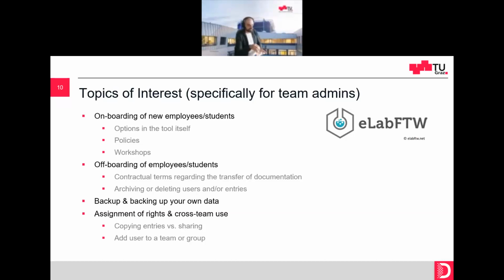So it's like a fourth or fifth option in these permission settings. There is no single case where the group option is always the right one. There are different situations, and depending on the situation, it is better to choose one or the other.